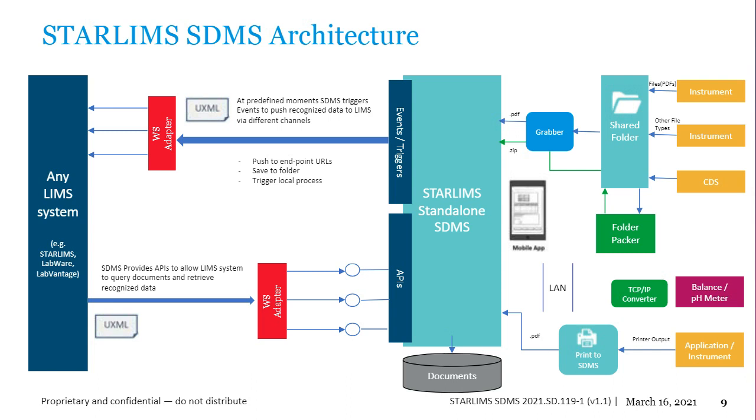It can be through HTTP or it can be a local script. This supports security tokens for authorization and authentication purposes. It enables the pushing of data via HTTP posts, and if it's not web-enabled, you can push data via local script or programs, and these results, these balance weights, can be passed as data arguments.